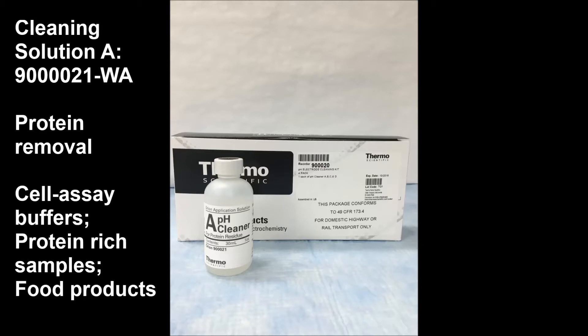Cleaning solution A is intended for protein removal. This would be for applications such as cell assay buffers, protein-rich samples, or food products with milk, cheese, and proteins.